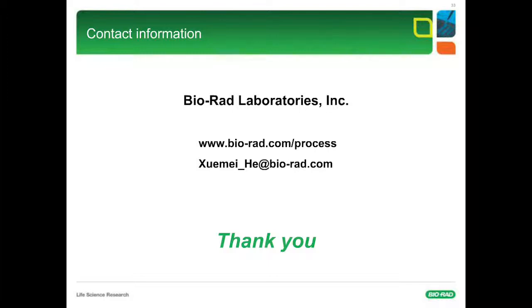Well, the next question is also related: how do you select the additive? I think you may have already answered a little bit. Yeah, I would always use arginine first. So start with arginine. That's a pretty good rule of thumb. Also, the table that's available in the presentation is a pretty good guide to help people understand what interactions we're modifying with the addition of the various additives.